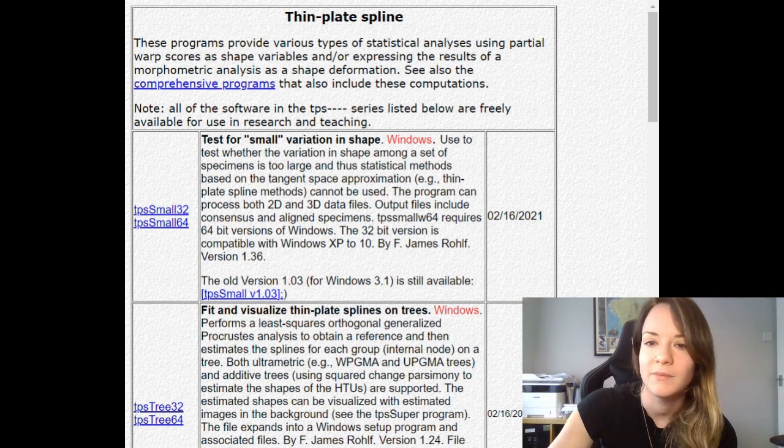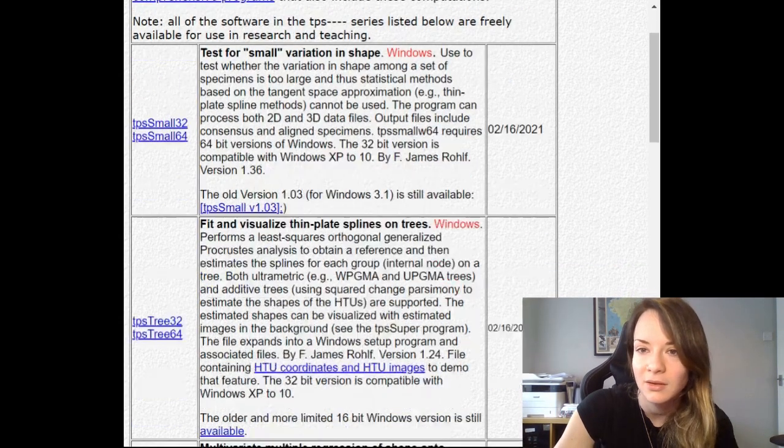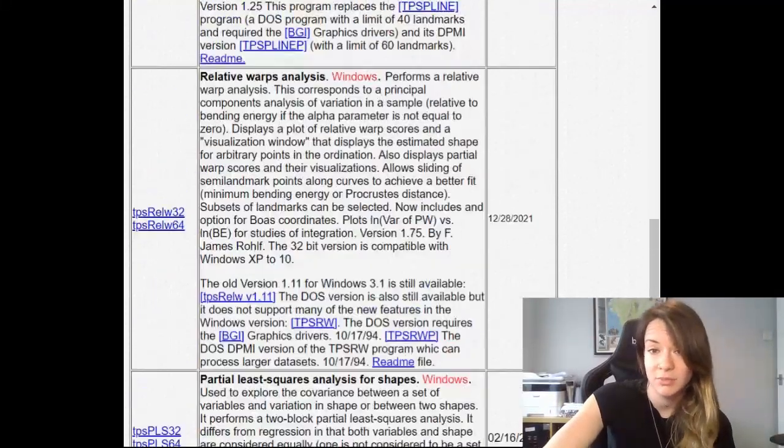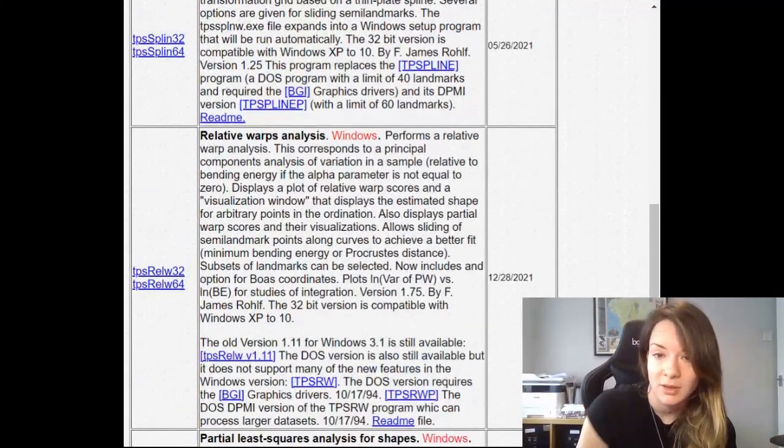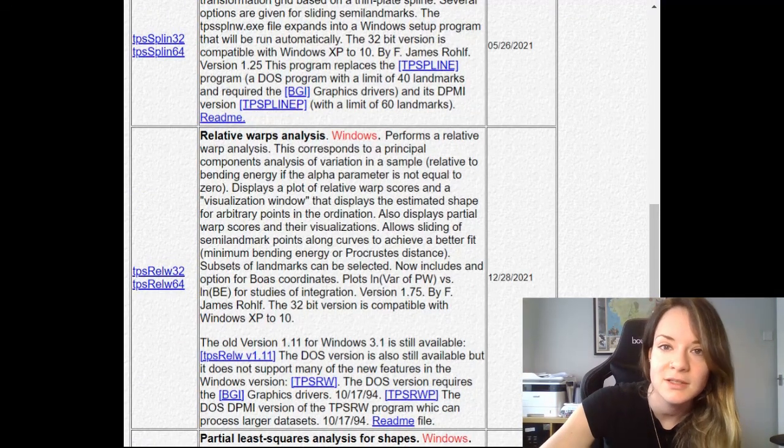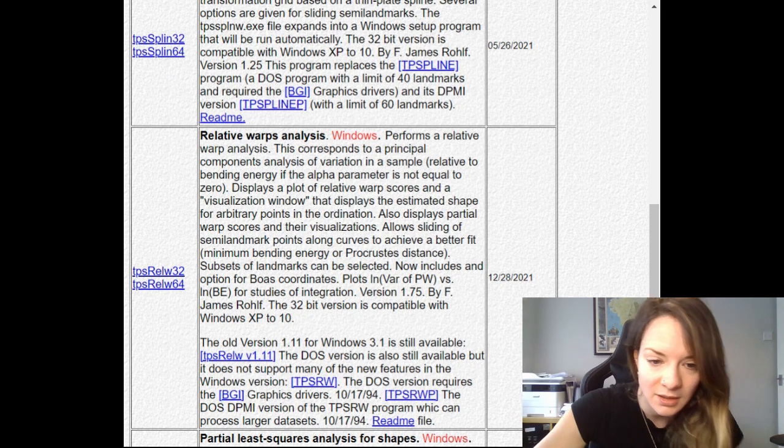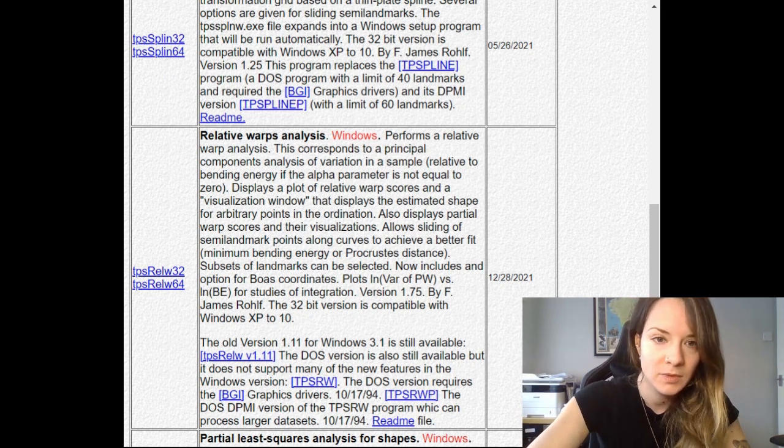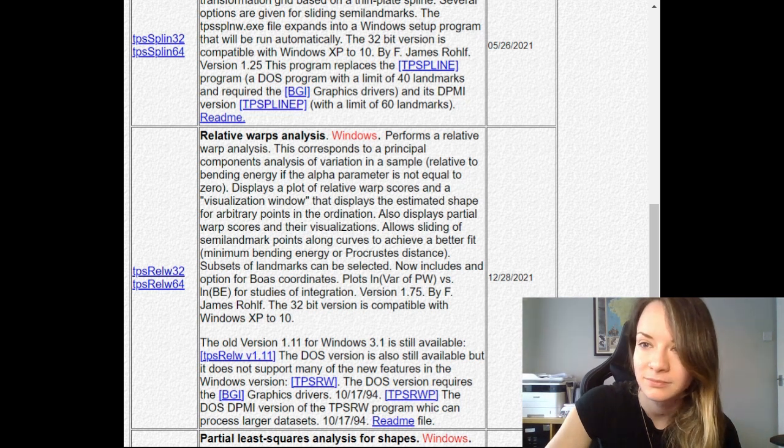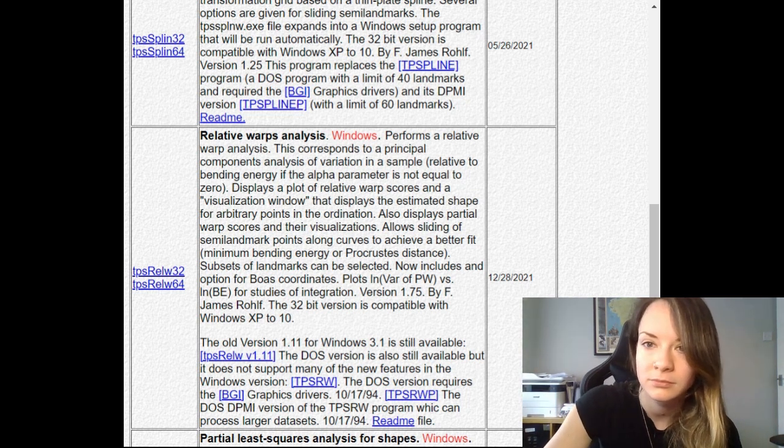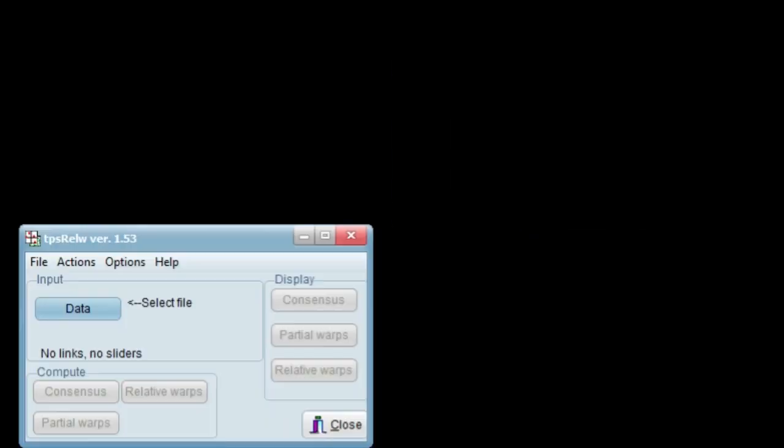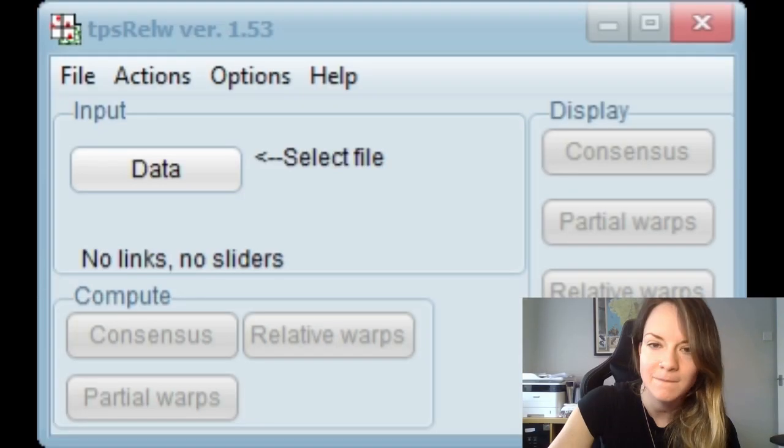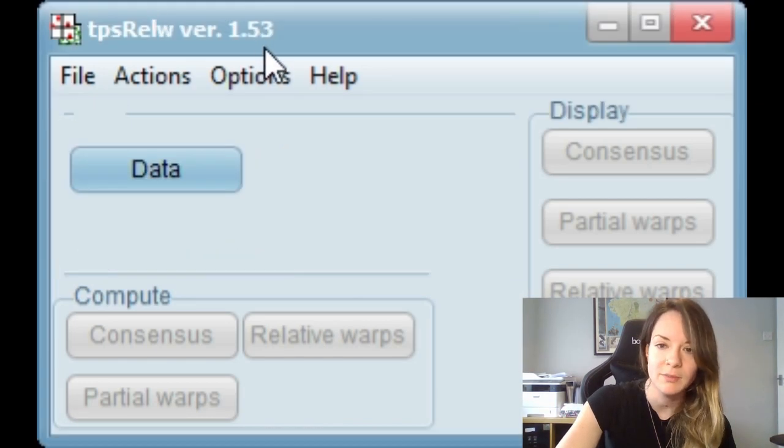So you can find the software here from the Stony Brook's morphometrics page, and here's a little description. So you can download it and then once you download it I'm going to open it up. So this is what it looks like, quite a simple program.